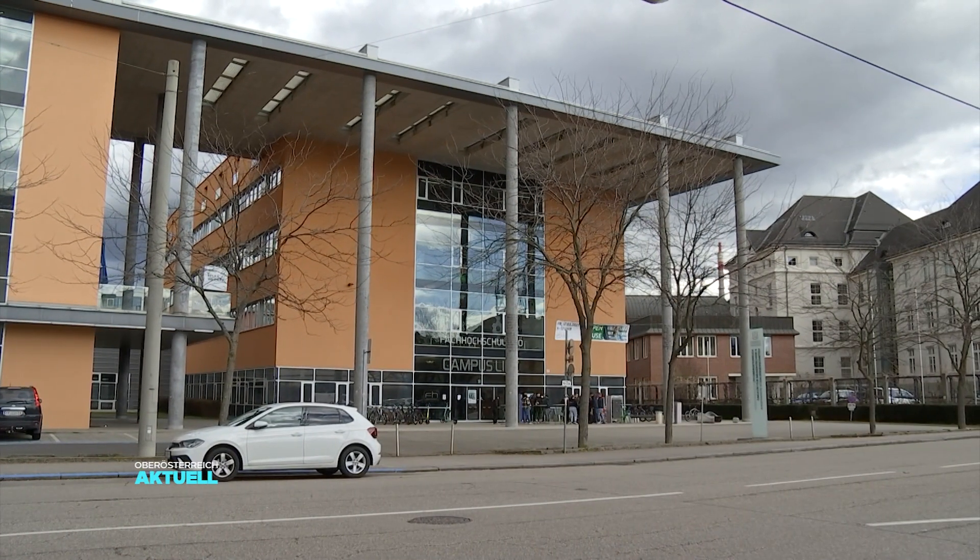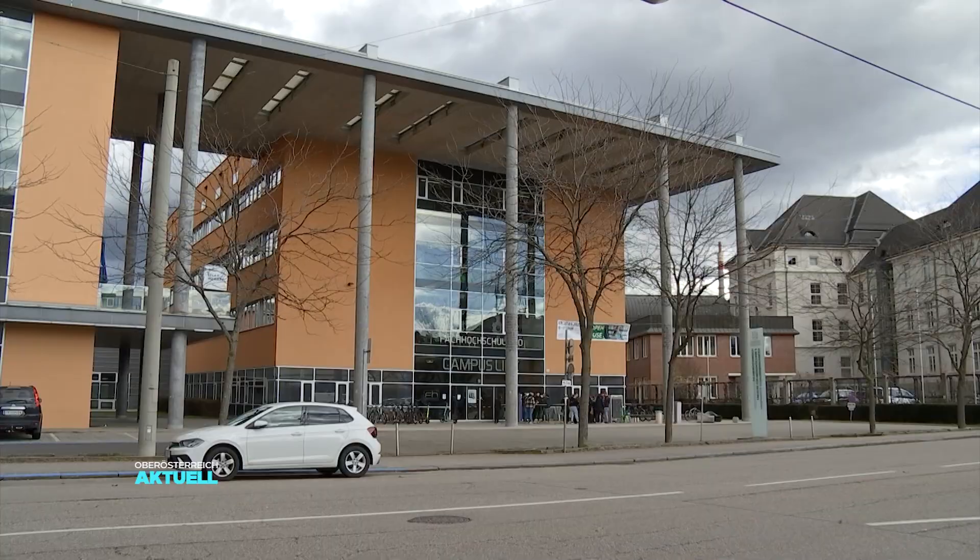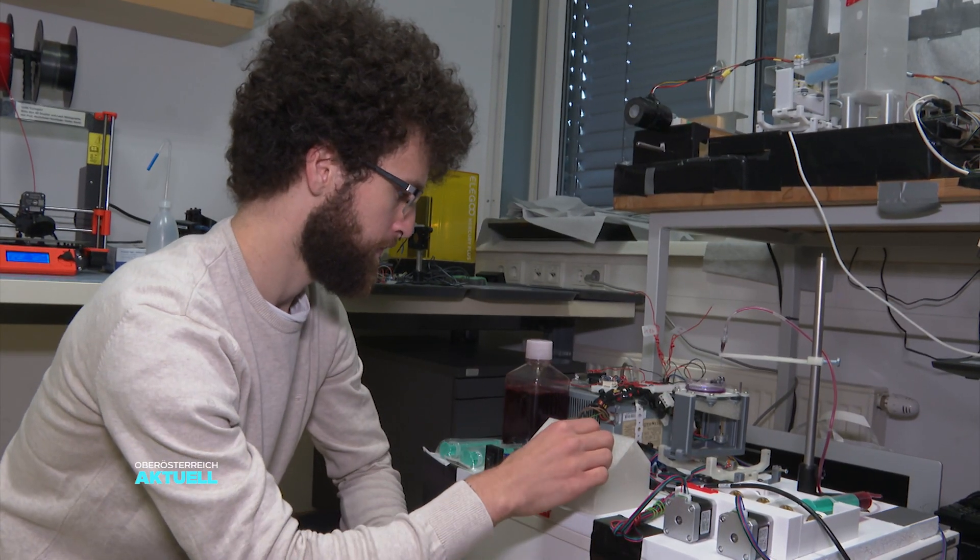The overarching idea would be to use cells from the body of the patient, which would mean own cells could be employed, and ideally the patient would get his or her own heart back. With this in view, medical researchers at the Upper Austrian University of Applied Sciences in Linz have developed a so-called bioprinter.